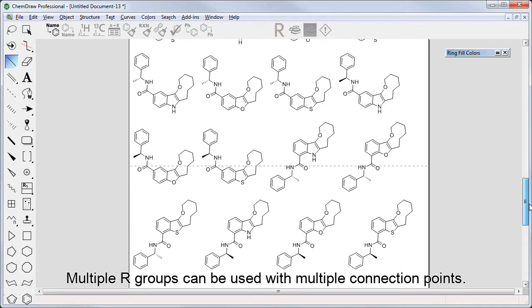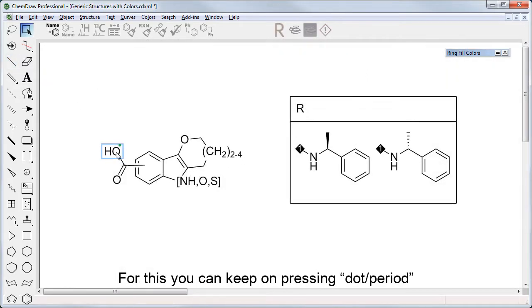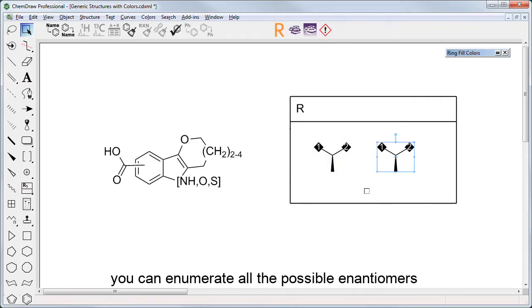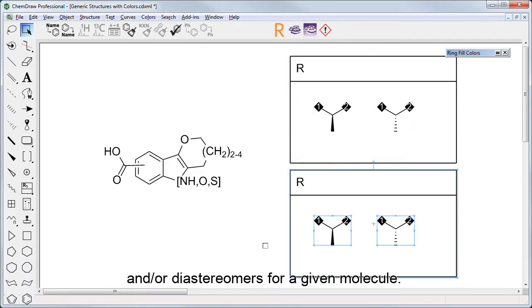Multiple R groups can be used with multiple connection points. For this, you can keep on pressing dot or period over a second atom, and this way you can enumerate all the possible enantiomers and/or diastereomers for a given molecule.